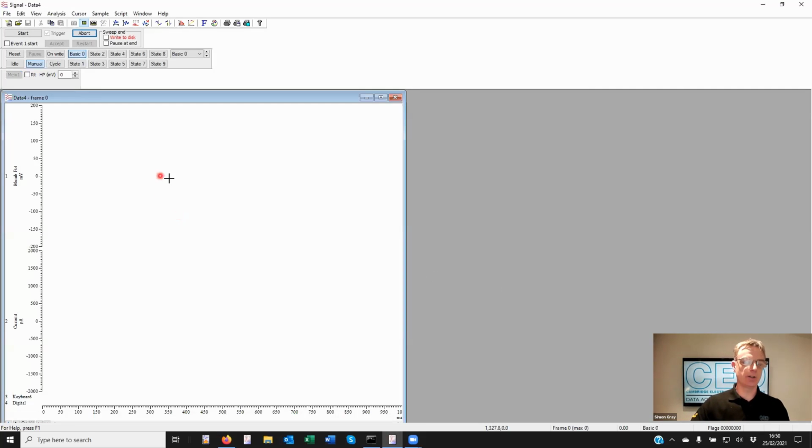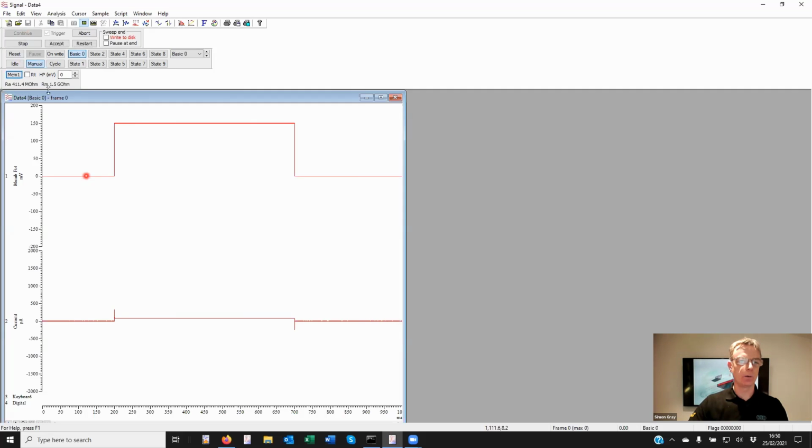If I'm having set up the clamping that I'm doing, we'll get this dialog here. The clamping bar appears when we actually sample, and you can see it's measuring the access resistance and the membrane resistance at the moment. If I click on this checkbox, I get the total resistance, which is probably what you want to do in setup.